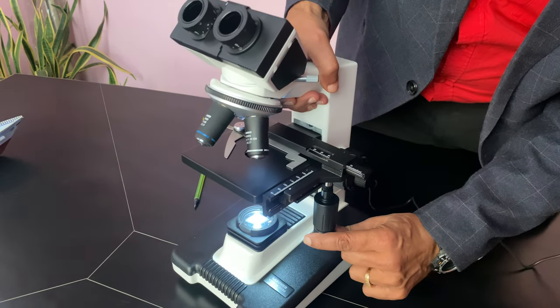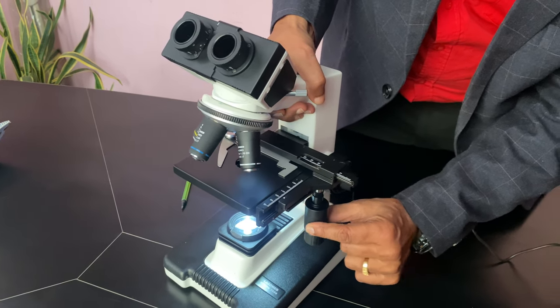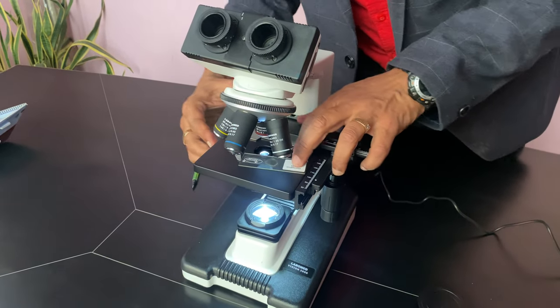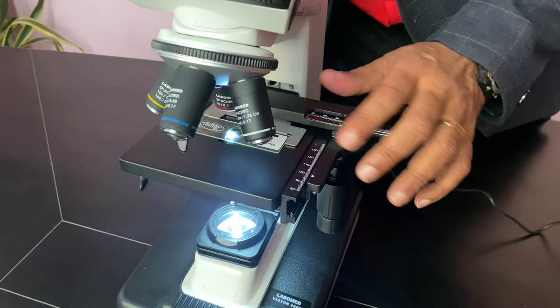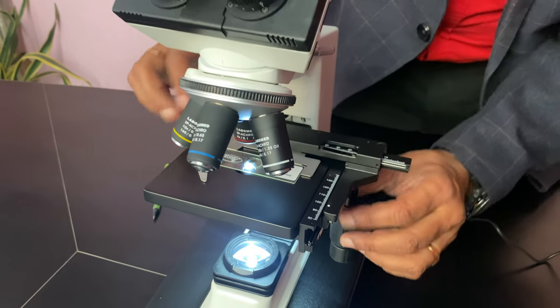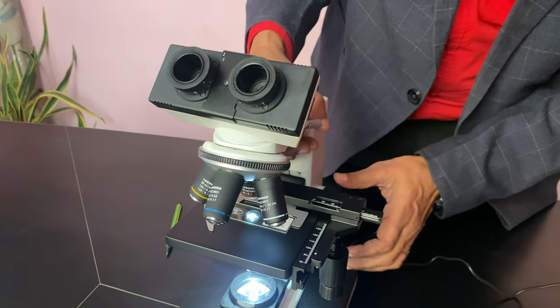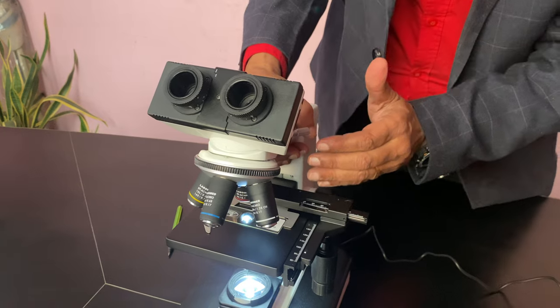Similarly, the stage movement is coaxial. When you put the slide — there is one slide which I am just putting as a sample — you have to put it so that the circle is in the center, and then you have to focus it.